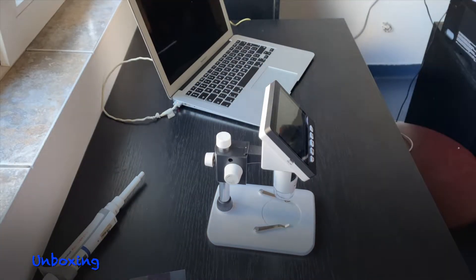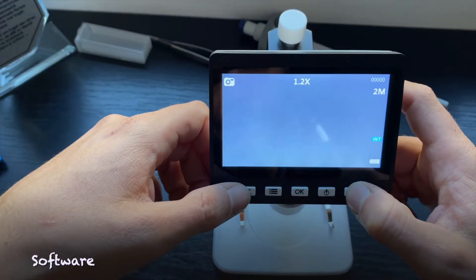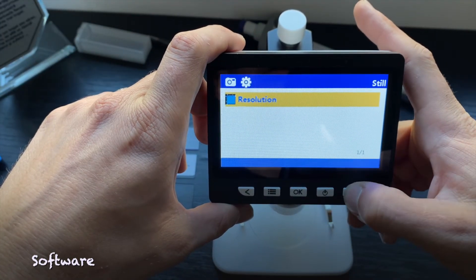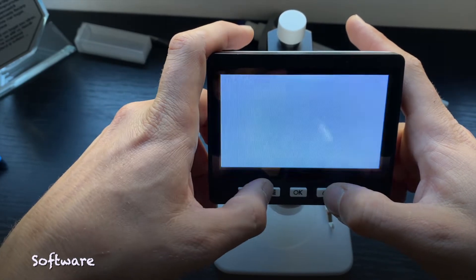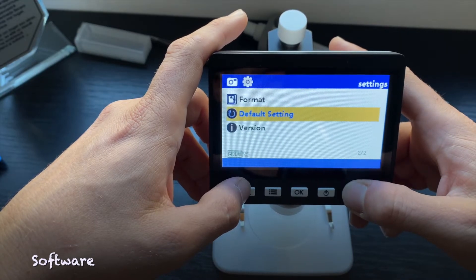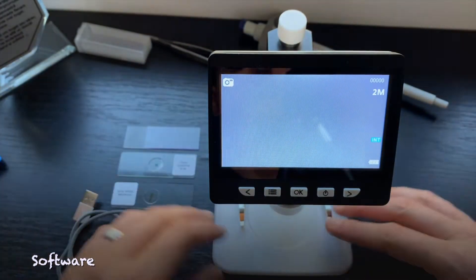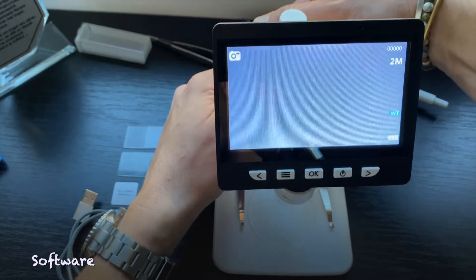Alright, so this is the microscope all set up. Let's get into the presentation of the software. Let's turn it on. Basically this is the screen. We have the right and left buttons which you can use as an additional 4x zoom. Here you have the menu — it has the resolution right here, so you can basically choose between 1 megapixel, 2 megapixels, and VGA. In the main menu you can set the language, the date/time, a screensaver, and a frequency — I don't know exactly what that one is about. You can set the format for your SD card, because you can also add an SD card for export. And of course you'll have the version and stuff like that.